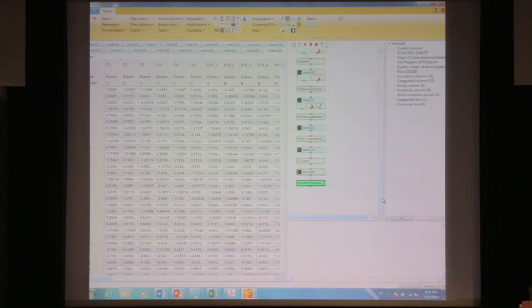Obviously, I'm not a statistician, but why are you z-scoring the data? Okay, so z-scoring basically brings all of the values into the same Euclidean space, and since we're visualizing in a heat map, we only have a certain dynamic range with which we can see large values and small values.